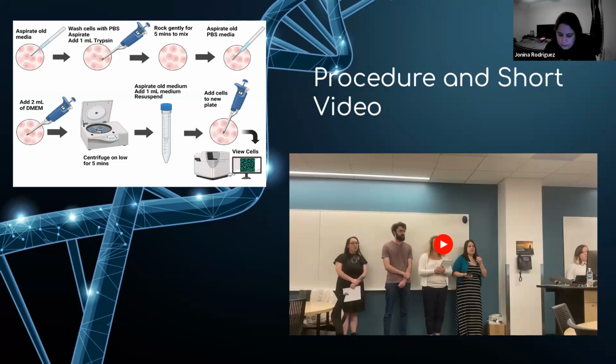your cells for 5 minutes, just to get everything good and mixed. And the one thing that you want to make sure of when you're using the centrifuge, which we were emphasized, is that it's even.